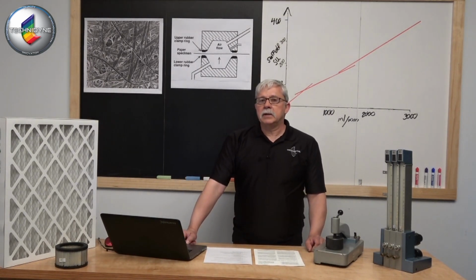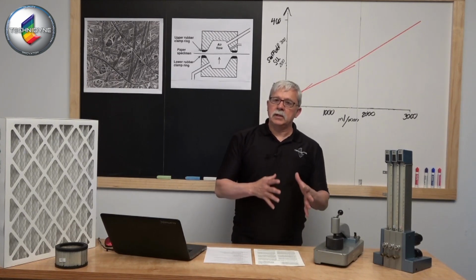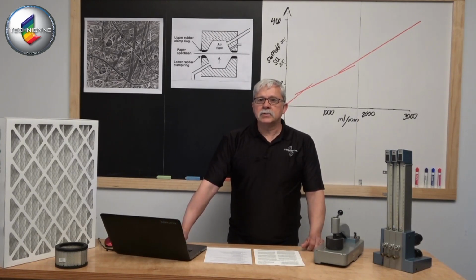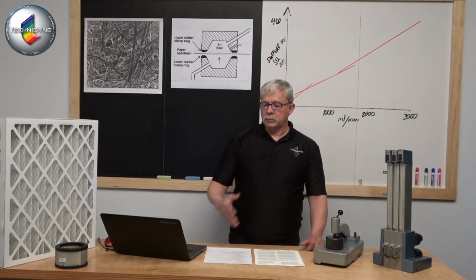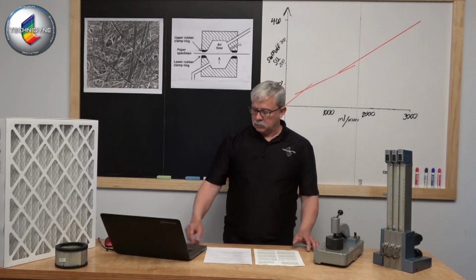I think one of the reasons behind that, and this is just some anecdotal information that I have, was that the Sheffield unit was never meant to be an instrument that you could use in one facility and compare to the results in another facility. They didn't design this system to be tightly repeatable and reproducible from one location to another. So I think that's one reason TAPPI or ISO held off and waited until some future developments took place before they turned it into an actual method.